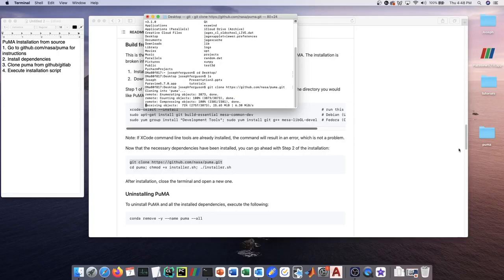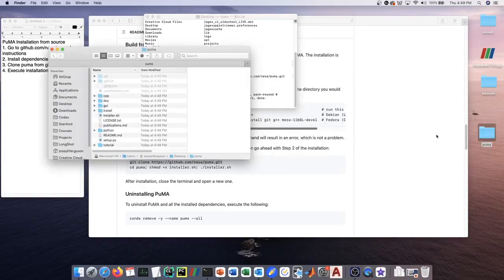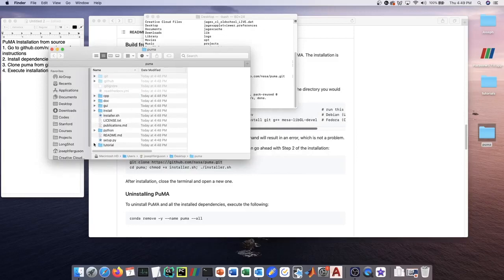It's going to download them into this Puma folder that in my case is here on the desktop. Once it's finished, I'll open it up and show you what's inside.